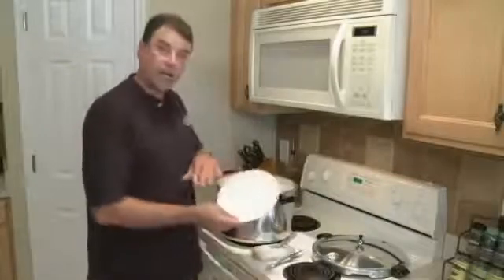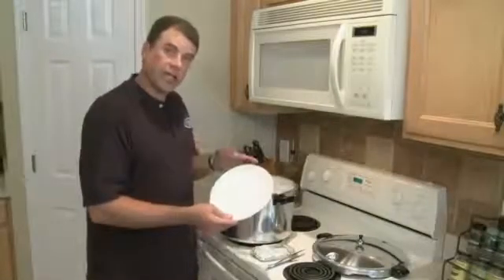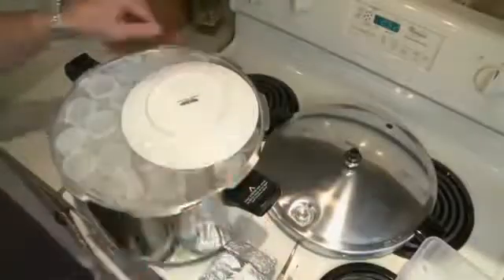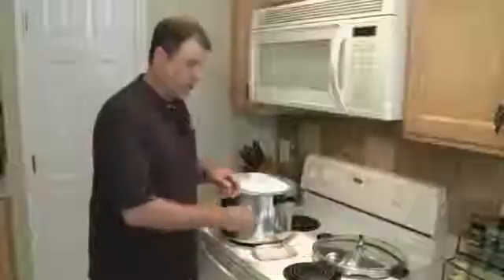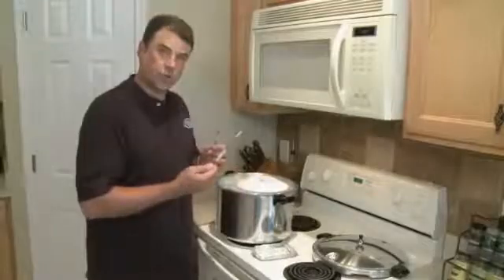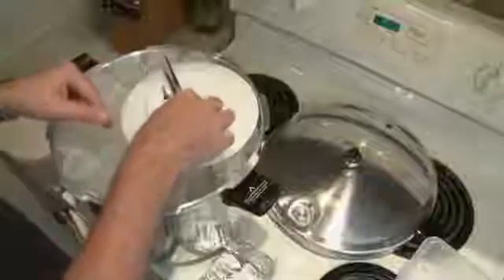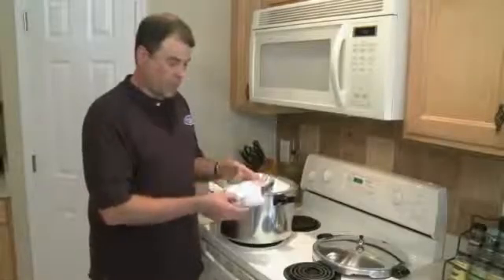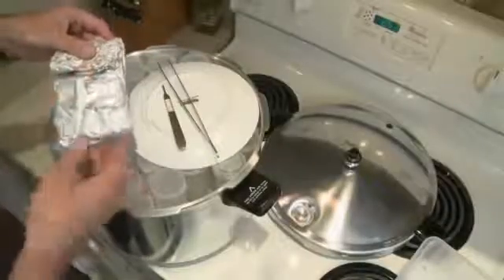Here is my smooth plate that we're going to be cutting the plants on later — I'll just drop that in upside down. Scalpel and forceps, which are included in your kit. And these are foil-wrapped white paper towels, and we're going to put those in here too.